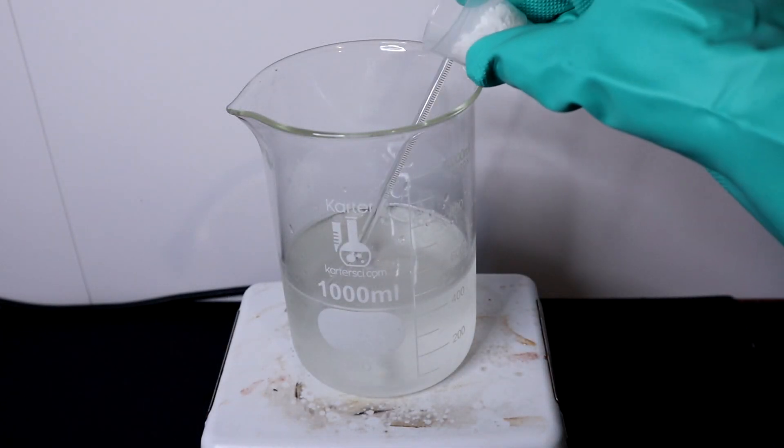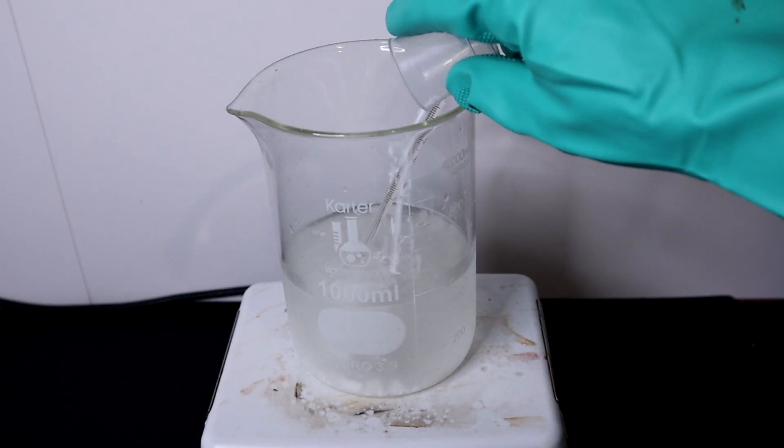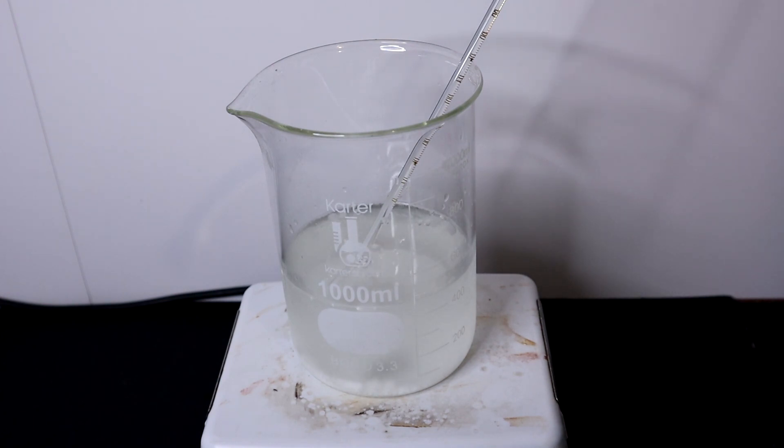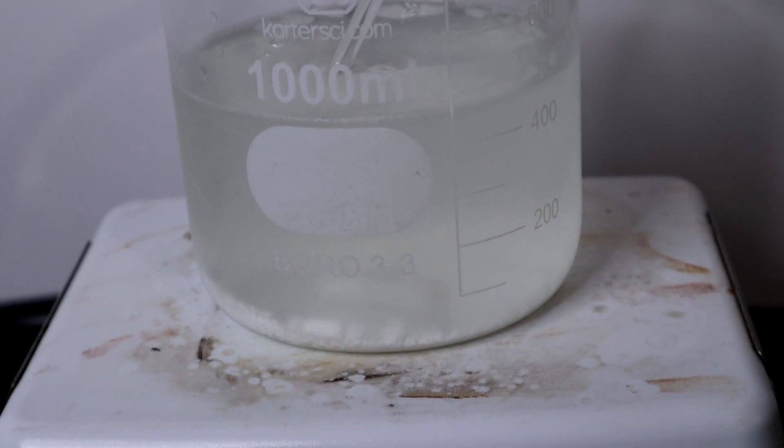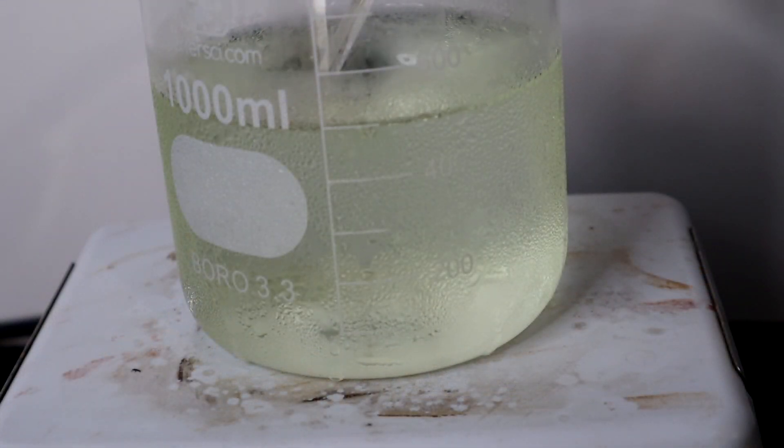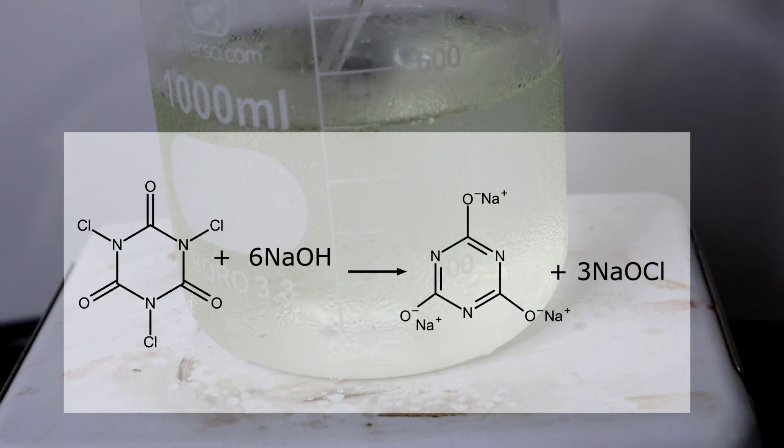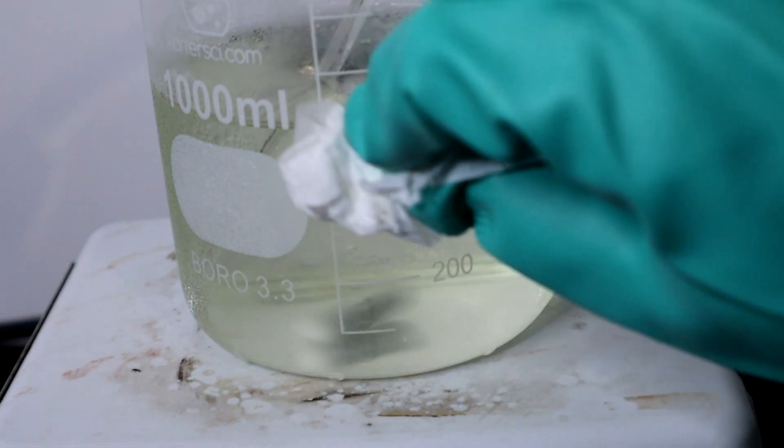After a few minutes of stirring I now add the 15.4 grams of TCCA which slowly dissolves. The solution turns a slight yellow green color. This is due to the reaction between sodium hydroxide and TCCA which generates tri-sodium cyanurate but also sodium hypochlorite, the active ingredient in bleach which is responsible for the color.